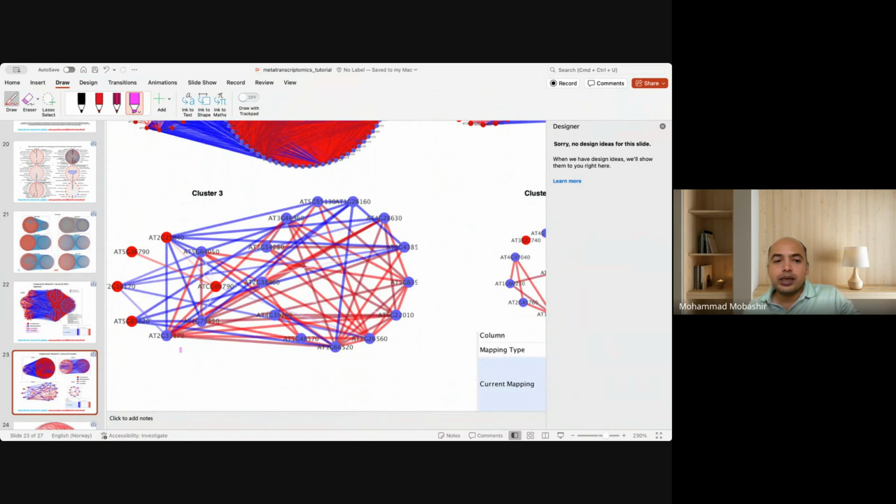Now go for a better, screened network from this complex network, then it could look like this. For example, this is one of the genes which is connected here, but they are connecting with a larger number of genes. Thus, you can say these genes are kind of master regulators.